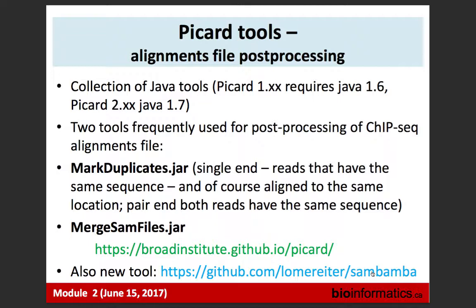So now, where else can we use Picard or Sambamba? One good practice in a ChIP-seq experiment is to multiplex. So we have several lanes, we have the same reagent, but we place certain pieces in different lanes. Then we avoid some biases, right? We avoid batch effects and stuff like this.